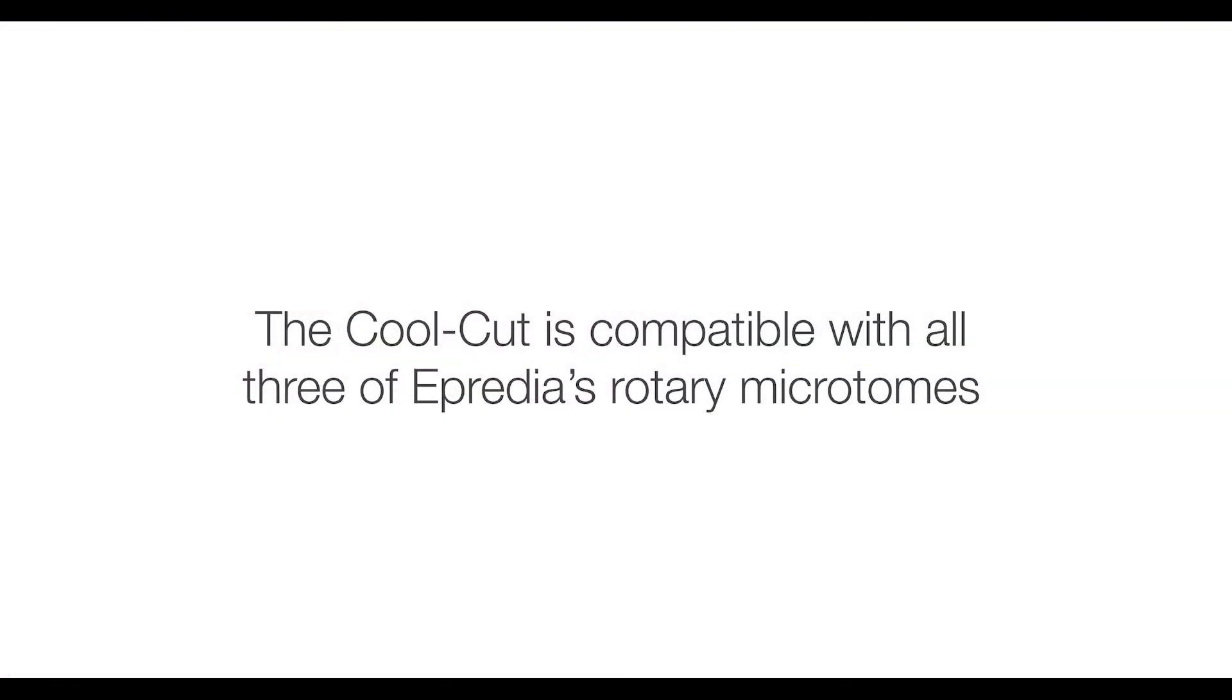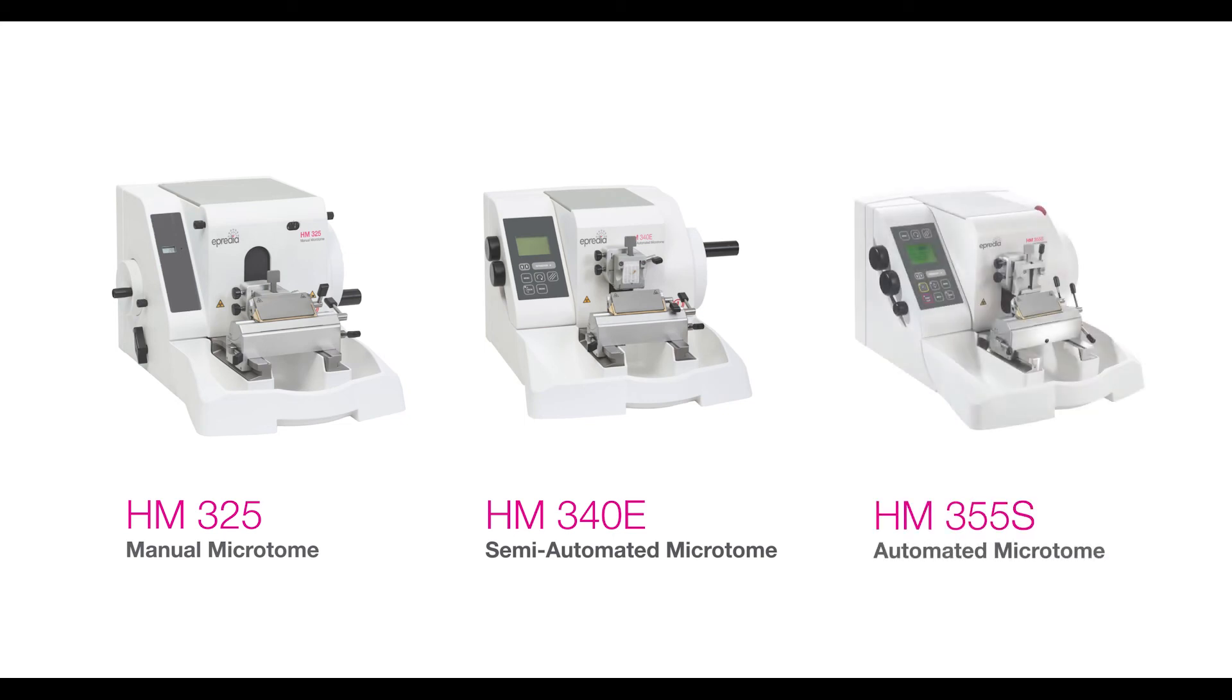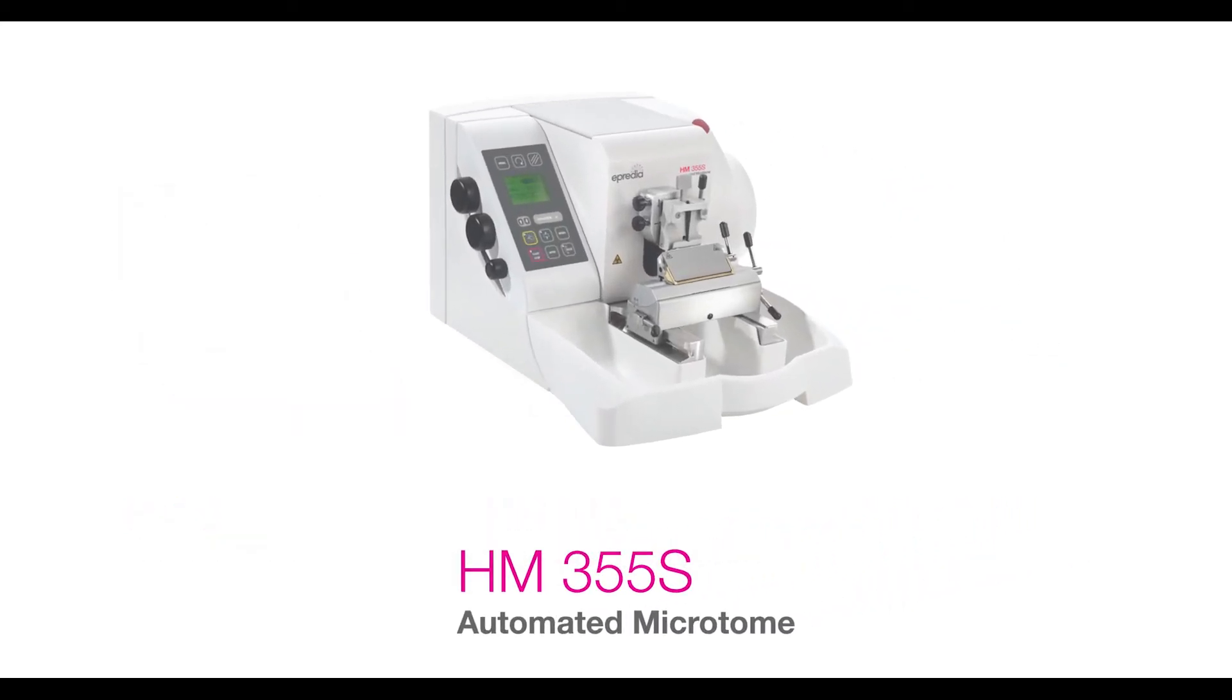The cool cut is compatible with all three of Epredia's rotary microtomes: the 325, the 340E, and the 355S. Here it's being demonstrated on the HM355S.